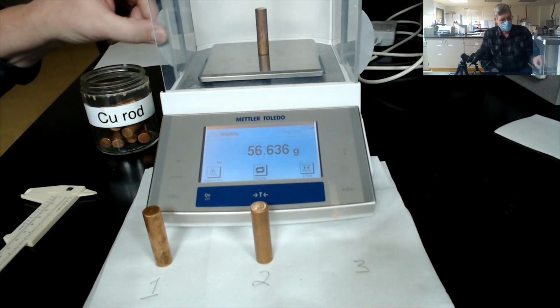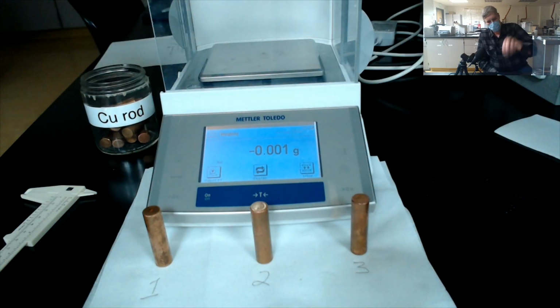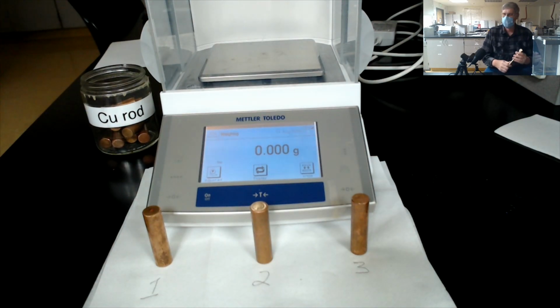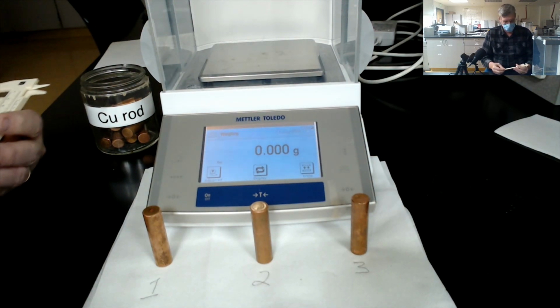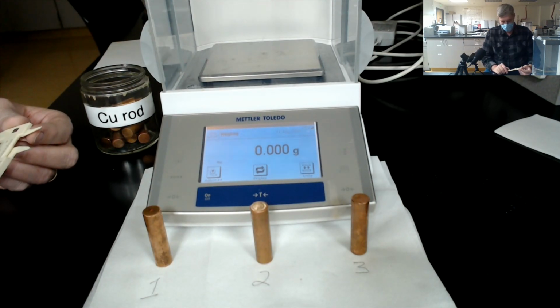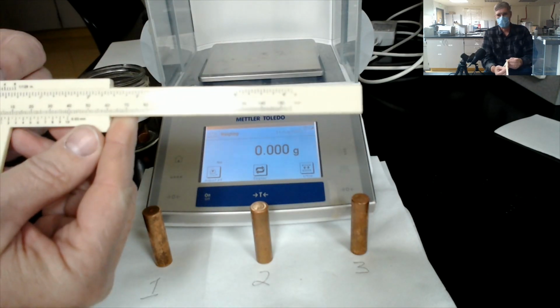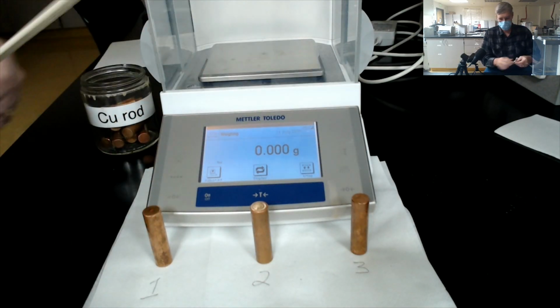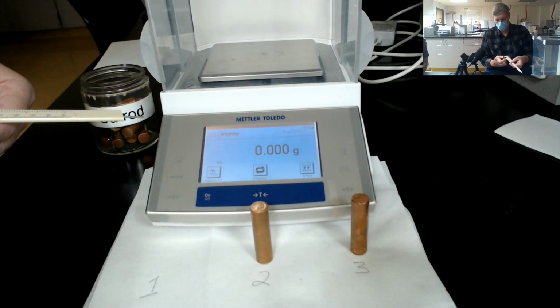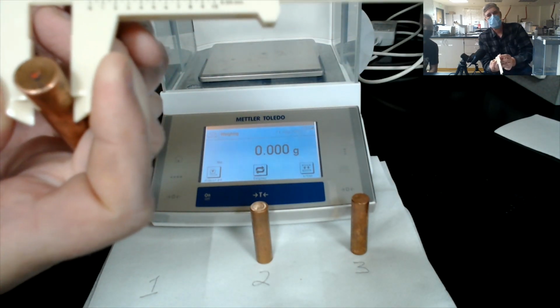Okay, we've now recorded the masses for these 3 rods. We're now going to take measurements so we can calculate density, and we're going to do this to calculate the volume, and we're going to do this 2 different ways. The first way is with this caliper, which we demonstrated earlier. We need to make a measurement of, first we're going to do the diameter.